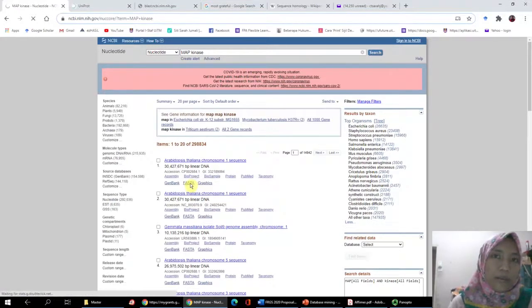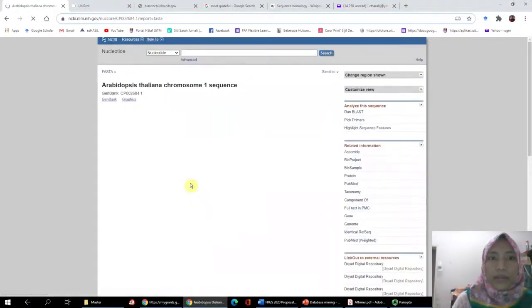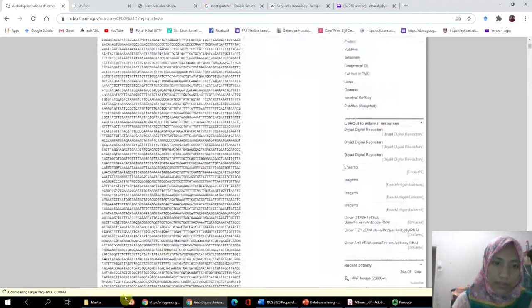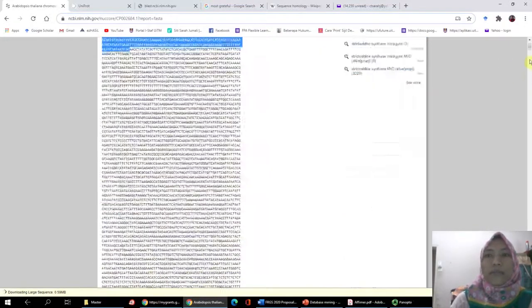Okay, so you have FASTA. You should go to the FASTA, and then what you need to do is copy from this side to the end. Okay, and you can get all those sequences.